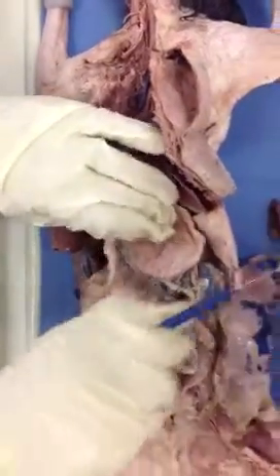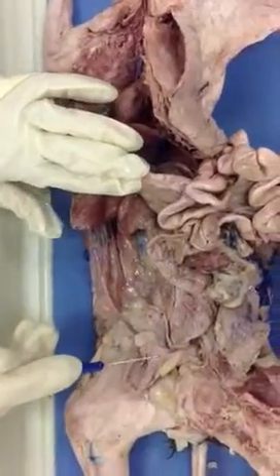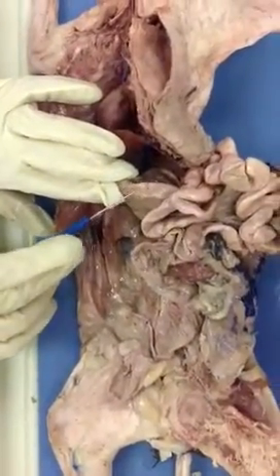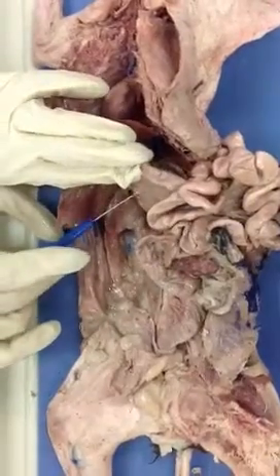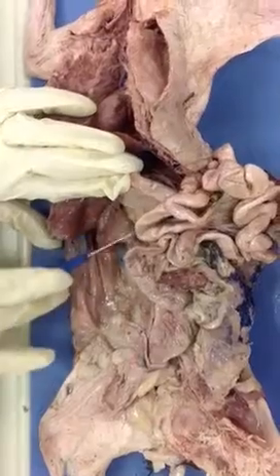Duodenum. Very good. Now if I flip it, does it go the duodenum, then the mesoduodenum? Because it connects to the dorsal body wall. The way that the duodenum stays in place is because it has this mesentery here in the bottom. You see it? And it goes from the duodenum to the dorsal body wall.